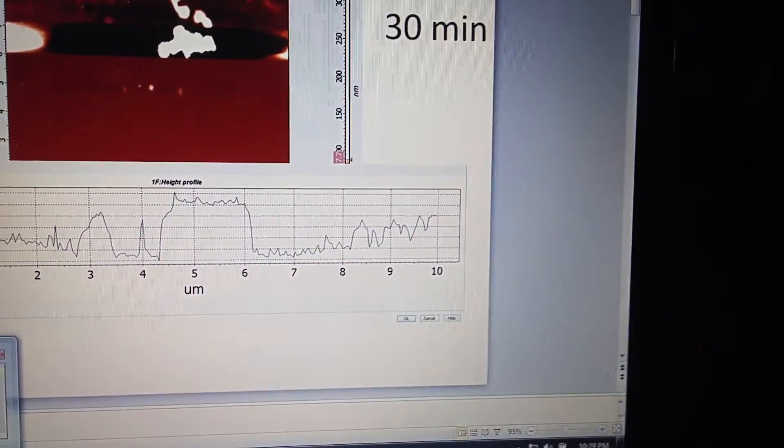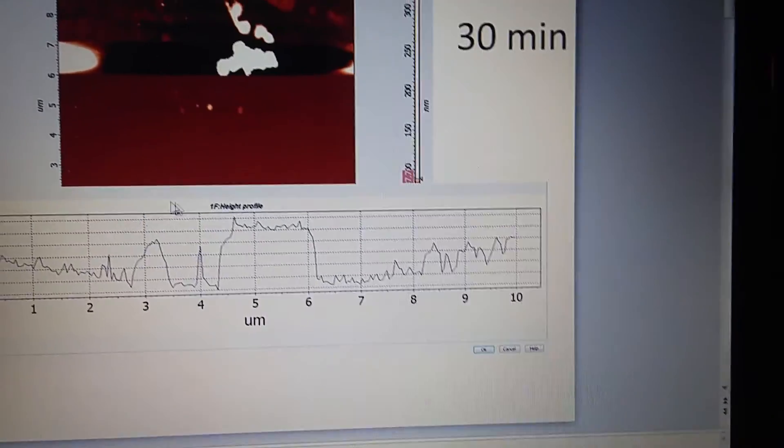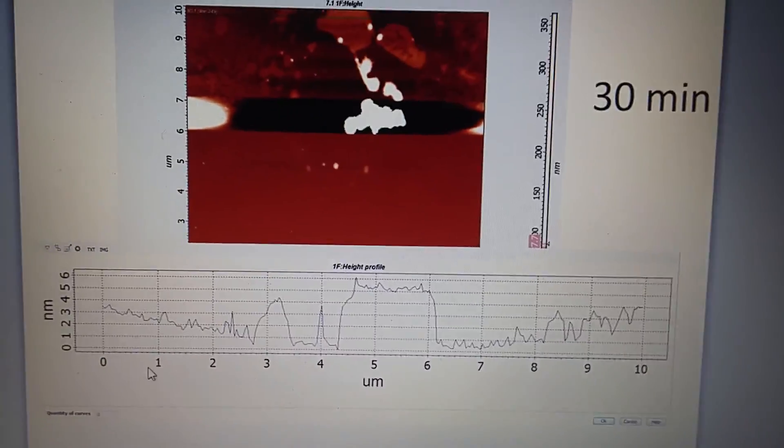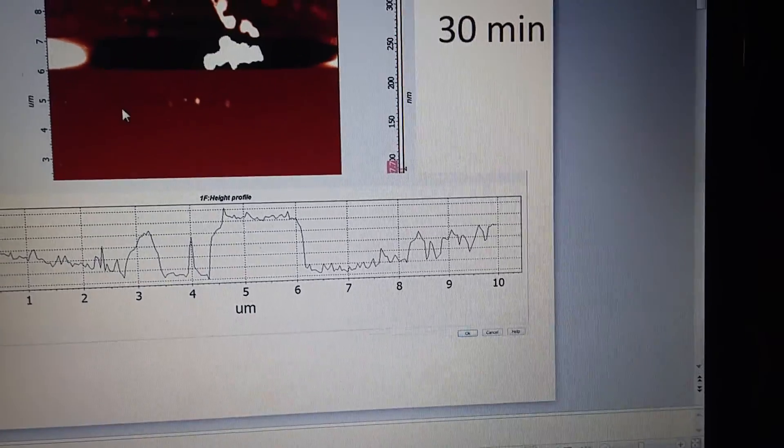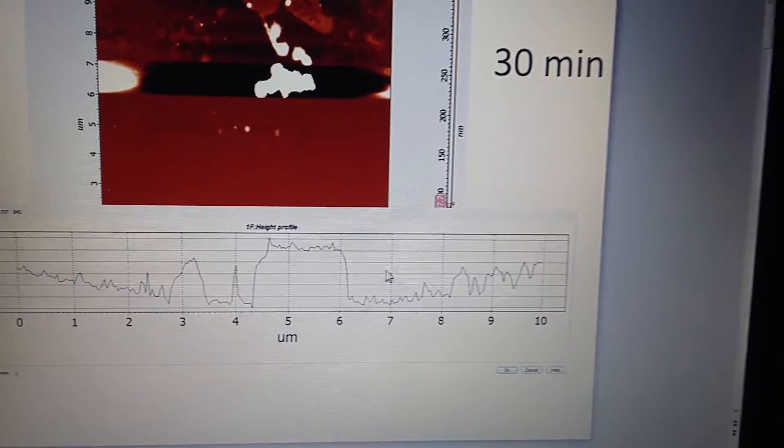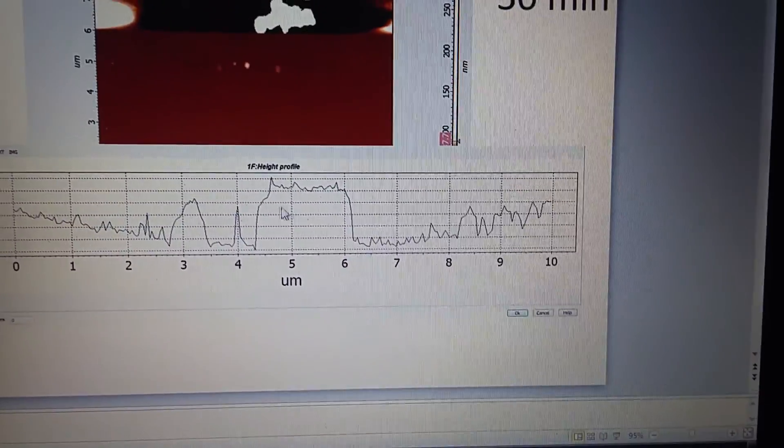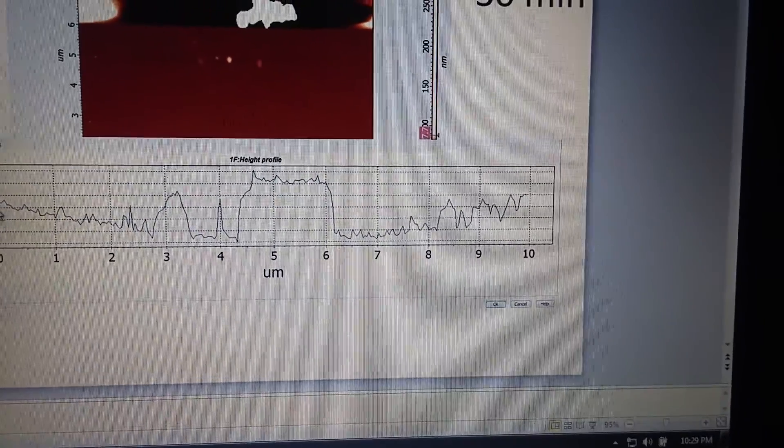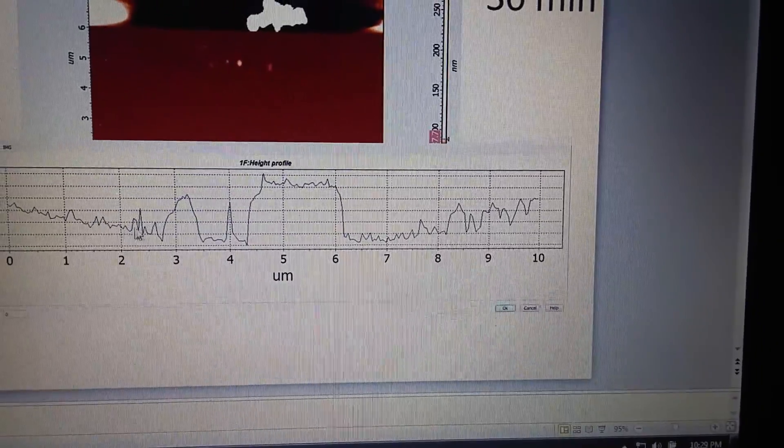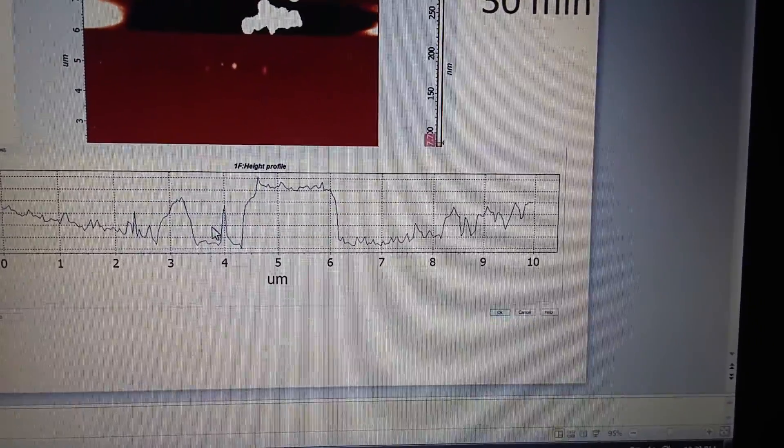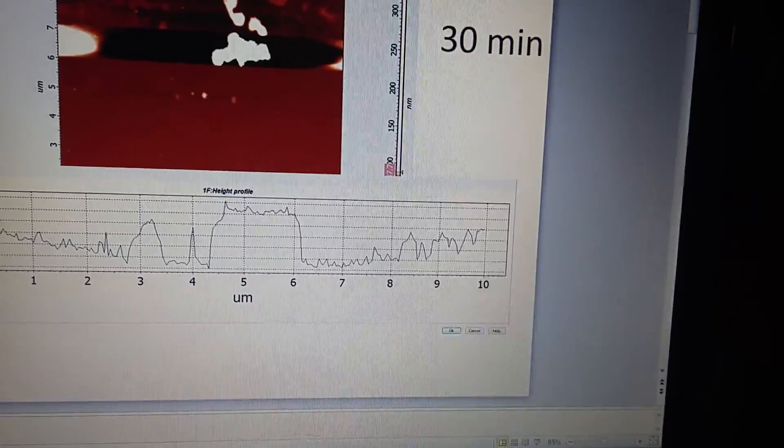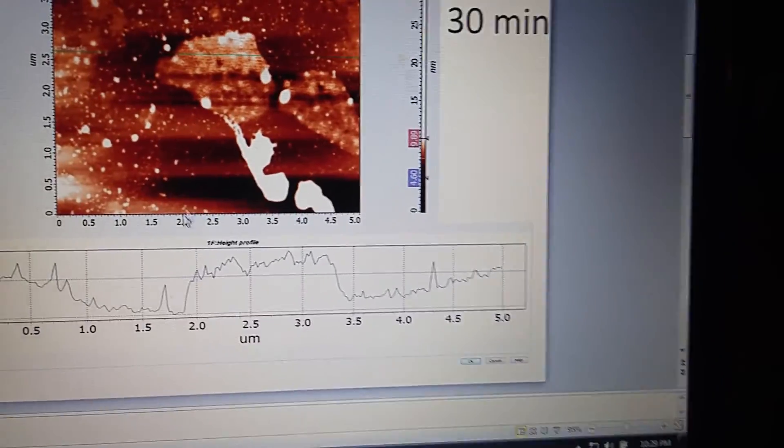And then here is another AFM images. And you can see this is, it looks like a topographical map. And the line, and you'll see there's a little, let's see, that line right there is where that topographical map right here shows where everything's at. And then you have literally, you know, down here, 1, 2, 3, 4, and then bumps and stuff like that. And that's where flakes are sitting, either rolled or whatnot.